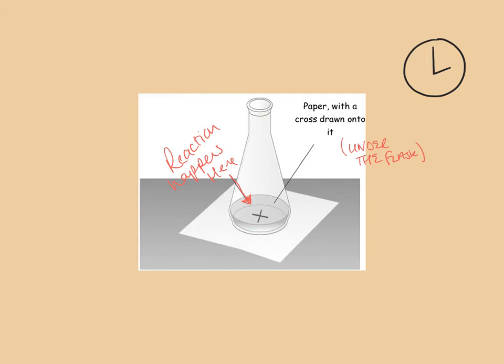So this particular practical is also a required practical, so there are two in this topic. One is for measuring the amount of gas produced over time to give you an idea of rate of reaction, which are the three equipment setups that we've already looked at. The other one you have to do is to measure one with a solid, where a solid's being produced, and this is the prime example. This is probably what you would use in a lab to be able to do that.